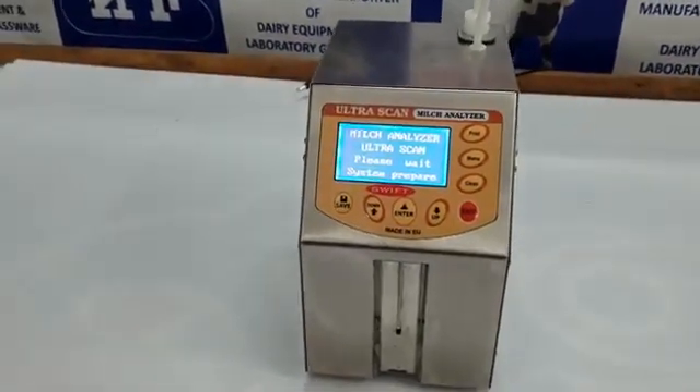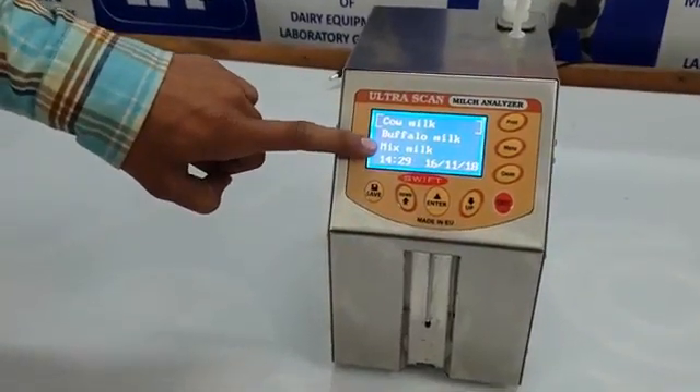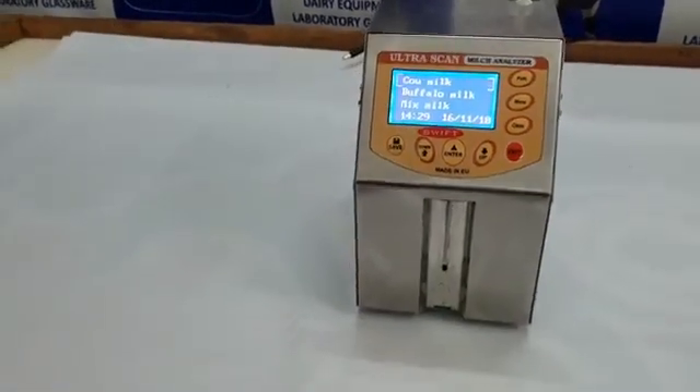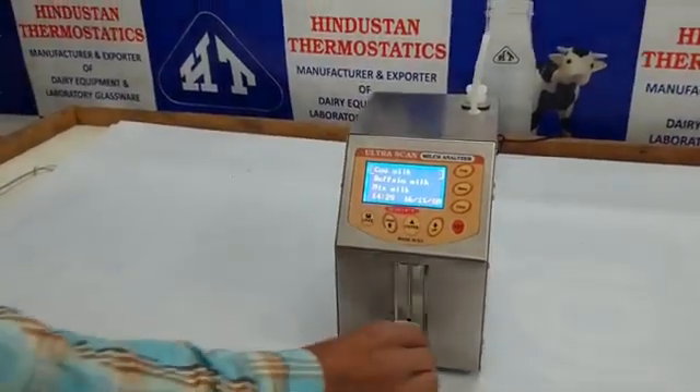Just switch on the machine and it is ready to work. The machine has three calibration channels: Cow, Buffalo, and Mix. It also features a real-time clock and date. We will now test a sample for cow milk — the machine takes exactly 18 seconds for its testing.